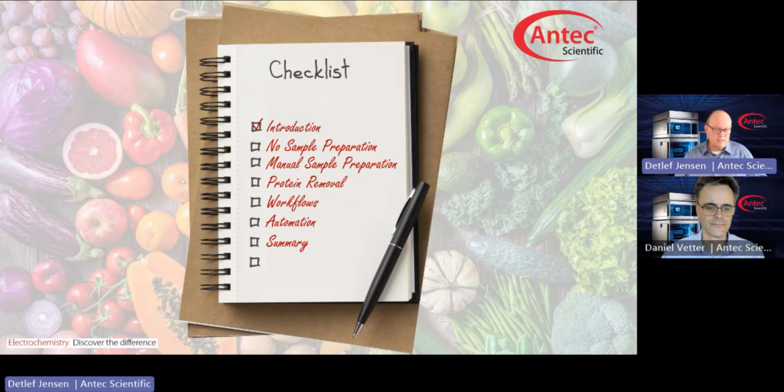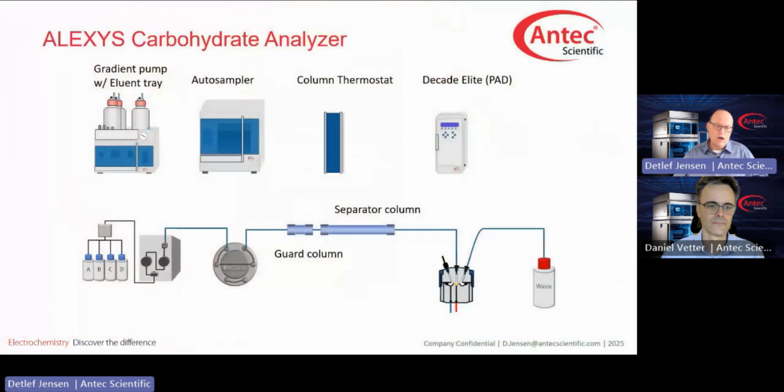What consequence does it have? Well, we'll have to look into the effects that no sample preparation has on our stationary phase, our column. Now, if you have your sample in a liquid state, you've dissolved it, and you want to inject it, and you don't do sample preparation, and you expect a matrix effect from your sample, then this little fellow here, the guard column, becomes your best friend.